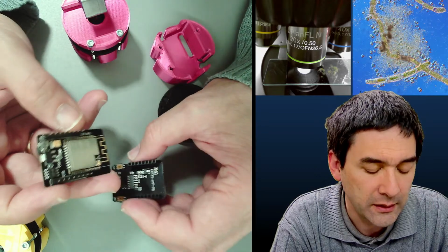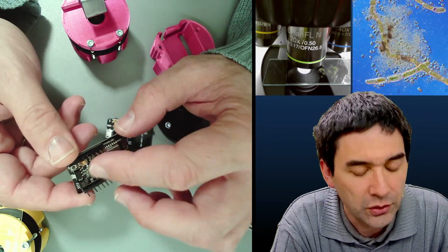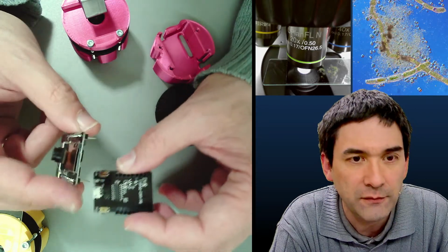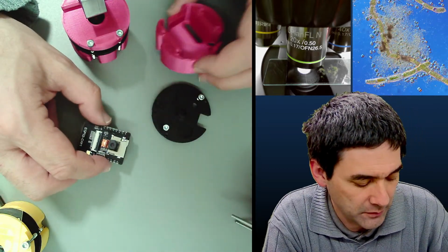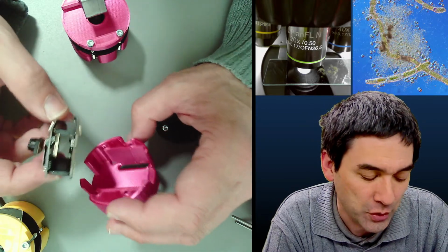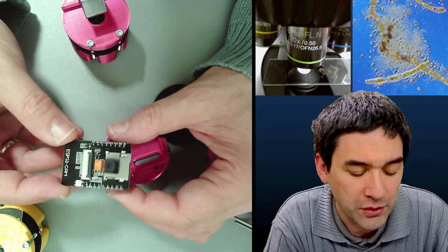However, if I'm correctly informed, if you connect the voltage directly to the correct pins here, you might not even need this part here. But this part is needed if you want to actually program it, but there is no programming necessary. So this is basically how this works. It's called the Matchboxscope because it has the size of a matchbox. It's an open source project, and these are readily available parts, so there's nothing custom.